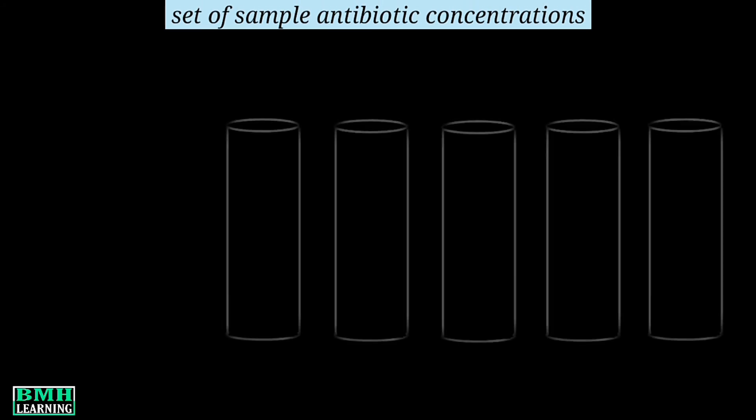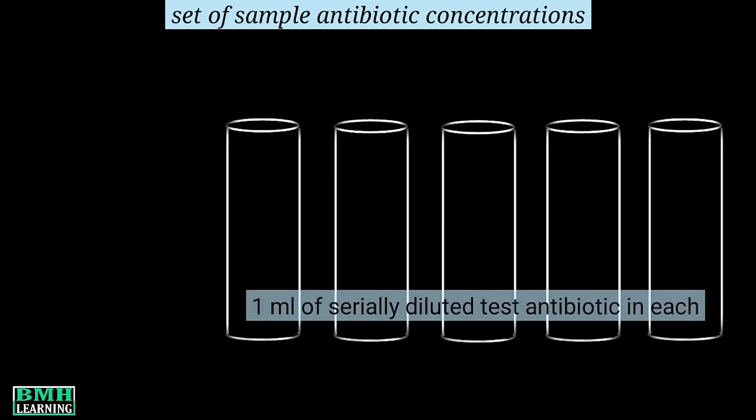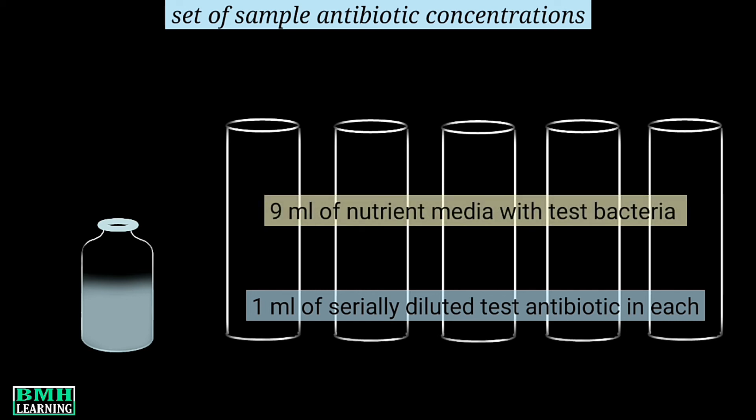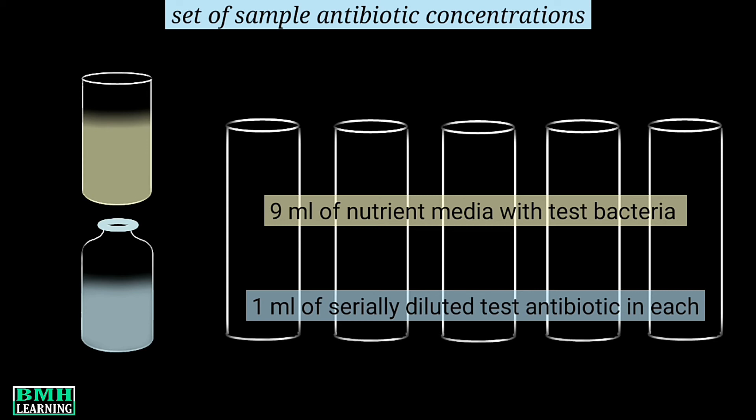Now let's make the same set for sample antibiotic. We have five tubes, and into these tubes we add serially diluted one ml of test antibiotic in increasing concentration. Similarly, we transfer 9 ml of nutrient media with test bacteria into these tubes.